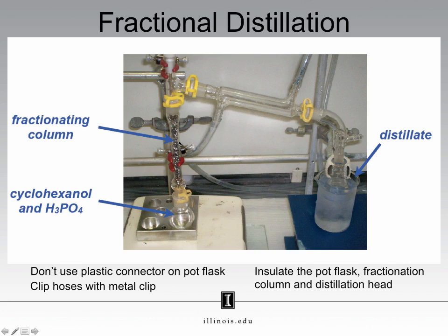This fractionating column is a glass tube which has been packed with steel wool. We'll talk about why steel wool is used in a little bit. Like with the simple distillation, do not attach your round bottom to the column with a Keck clamp, otherwise it may melt.